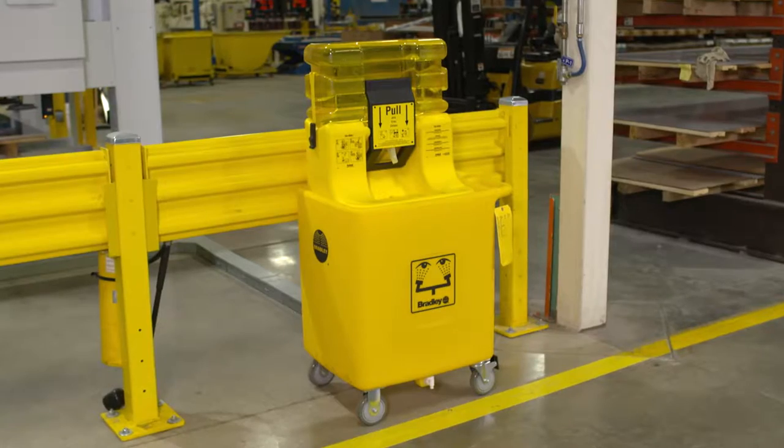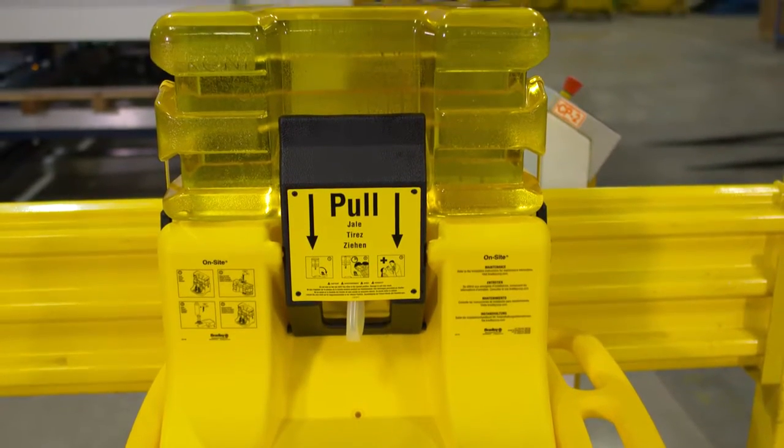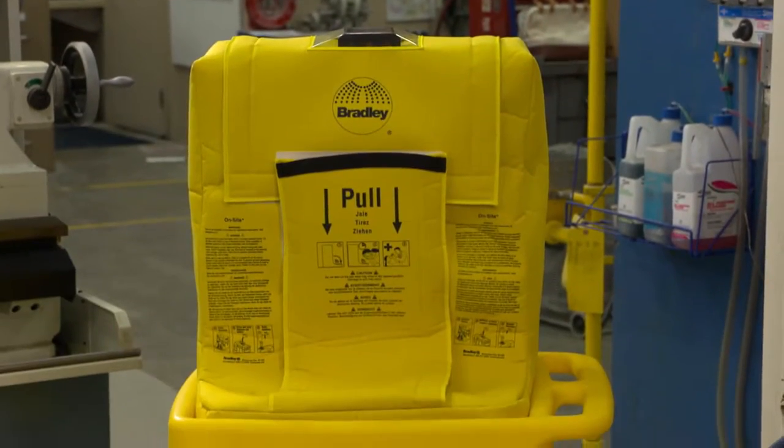Bradley's on-site portable gravity-fed eyewash is the ideal safety solution when a plumbed water supply is unavailable in your facility. In below freezing conditions, your unit will require a heater jacket.